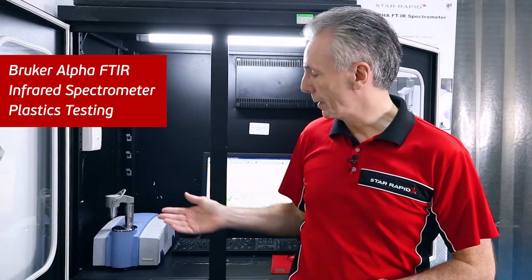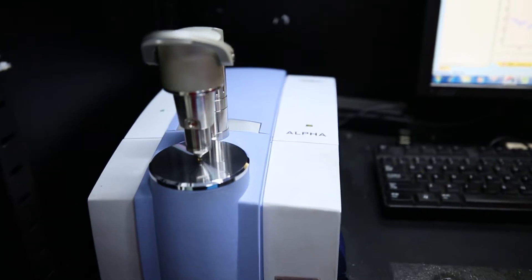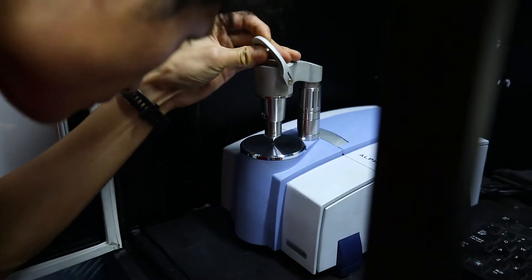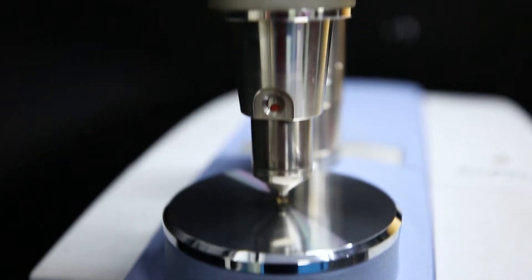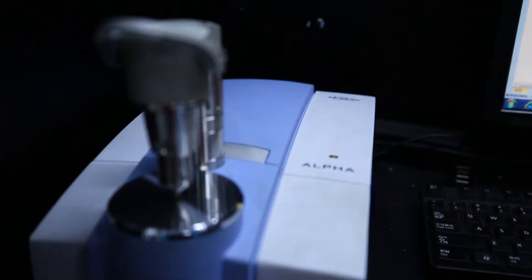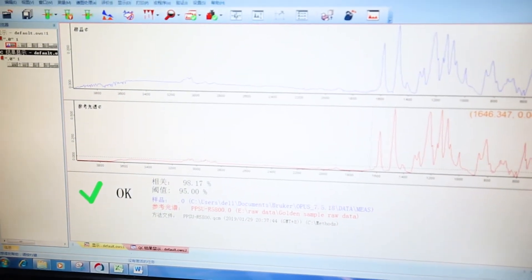And finally we have this amazing piece of equipment here, the Bruker Alpha FTIR machine. FTIR stands for Fourier Transformation Infrared. You take a resin pellet, put it underneath here, clamp it down, and shine a monochromatic light source onto the organic material. The light waves are shifted into different frequencies, they bounce back, and you get this kind of fingerprint as you can see here.